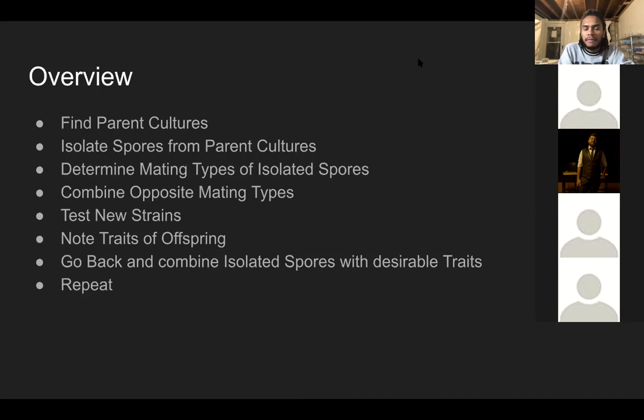No, 95 degrees Celsius won't damage the DNA. It'll help it go into solution, but if you do get hotter, it can start to damage the DNA. So 95 degrees Celsius is just where you want to be. I don't care about the pressure buildup. If you have a heat block, you'll have something that can hold the caps down.